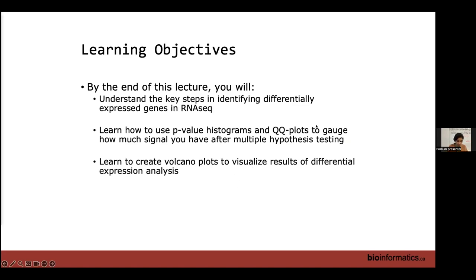You will learn how to use QQ plots to gauge how much signal you have after multiple hypothesis testing. We tend to do a lot of multiple hypothesis testing when we do genome-wide studies, and we are trying to find a signal amidst all our genes, so how do you adjust for that? And then we will create a very common visualization called a volcano plot to look at the results of differential expression analysis.